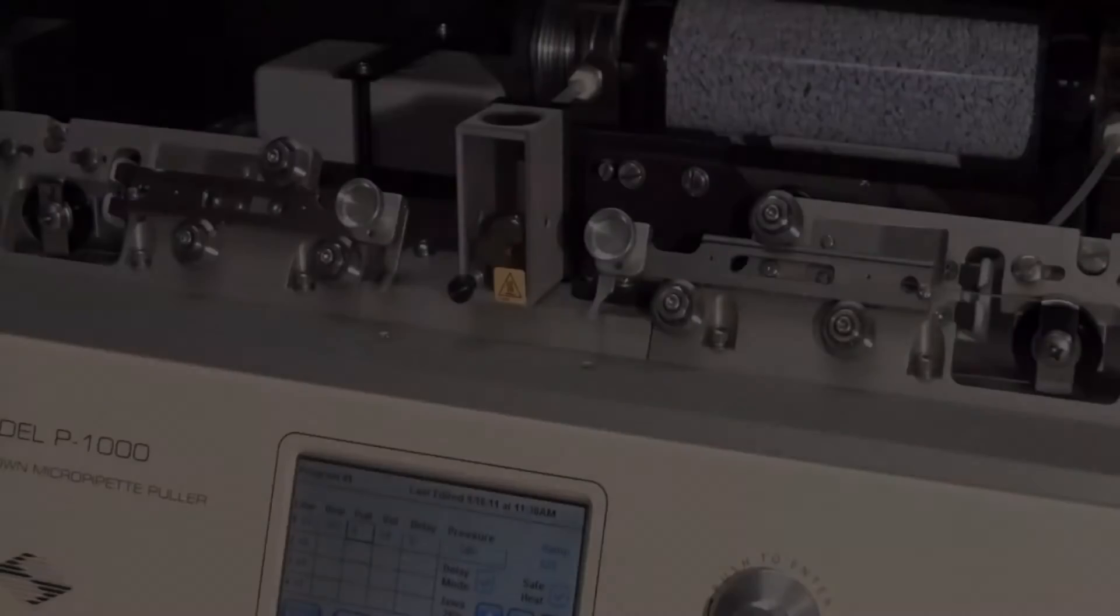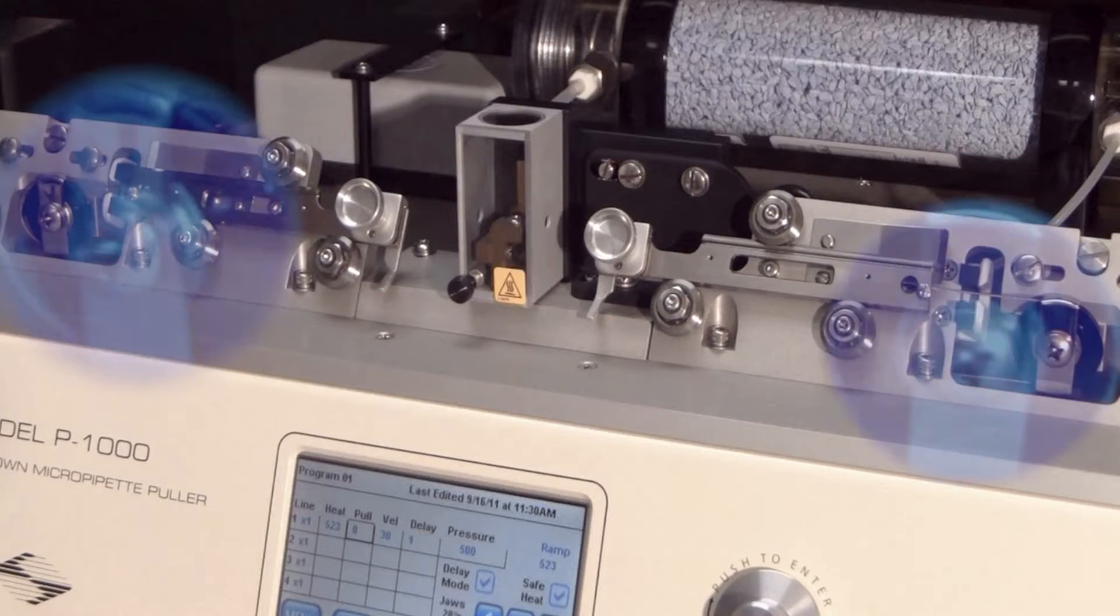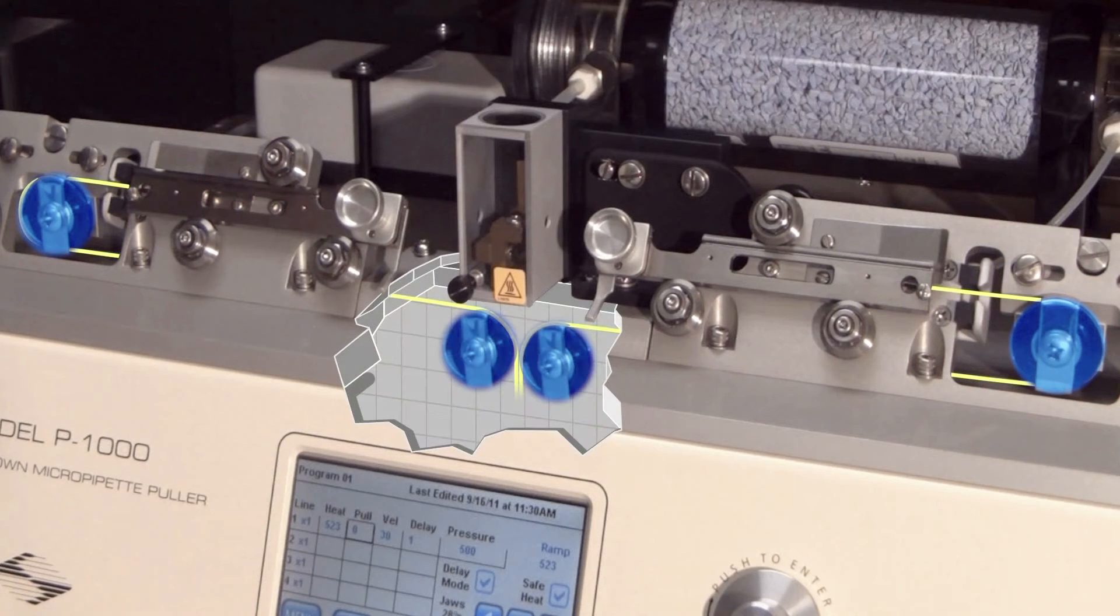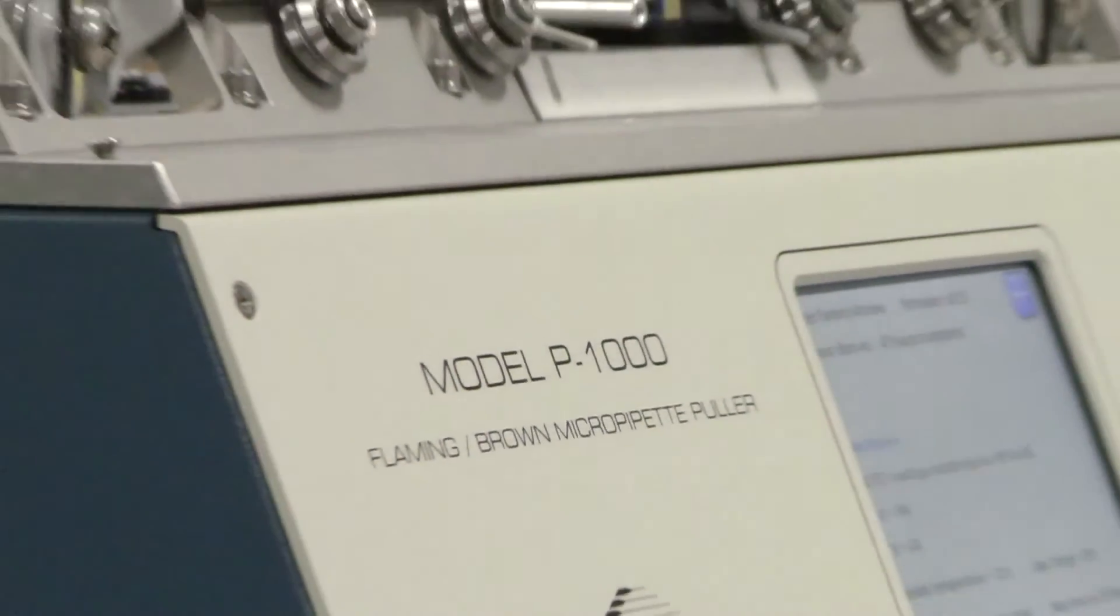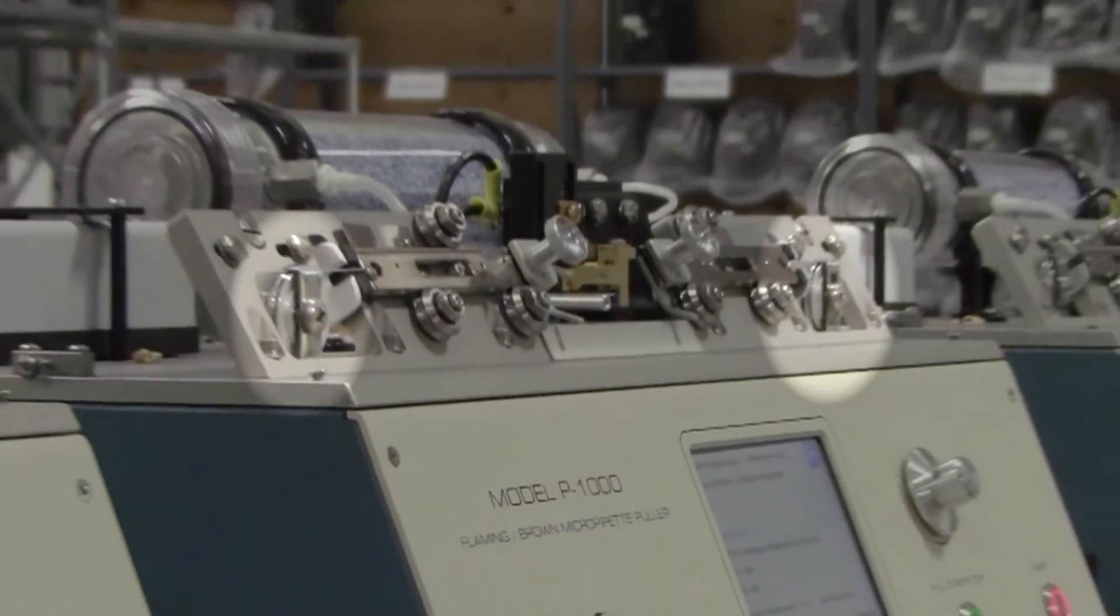Each SUTTER horizontal puller has four pulleys, one on each end of the upper pulley assembly and two lower pulleys concealed underneath the heating element. The pulleys on your instrument may either be silver as seen on the P1000 puller here or black.